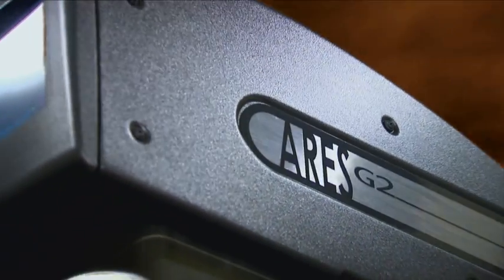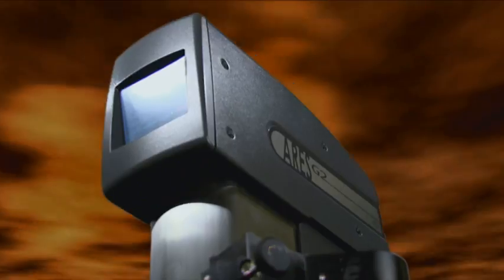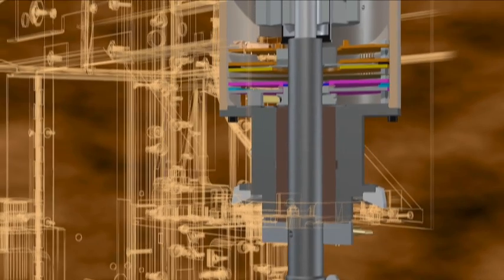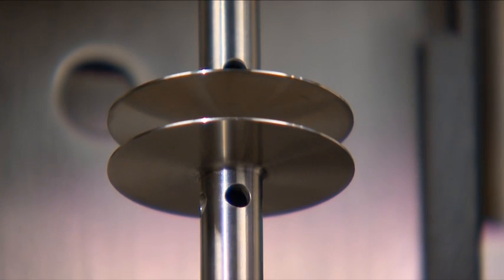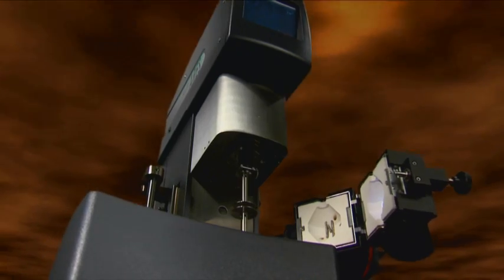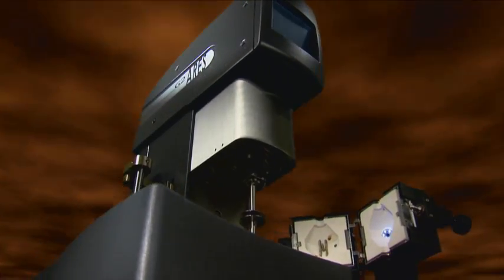A revolutionary, intuitive interface. Unique separate motor and transducer technology. Independent stress and strain measurements. Complete rheological characterization for any material. And the purest rheological measurements.